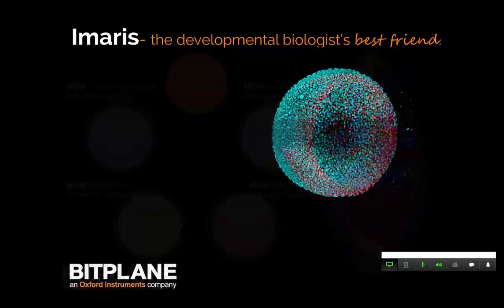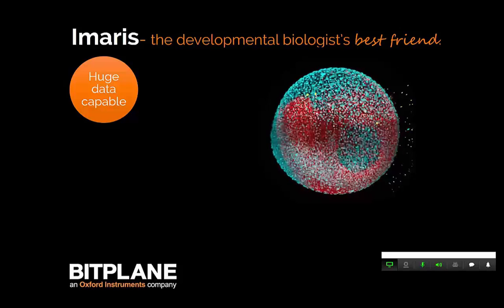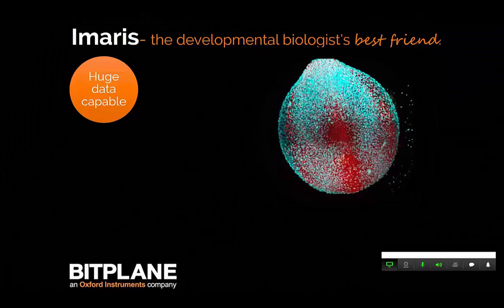So, to get things started, we have a zebrafish embryo, I believe, that was collected on a light sheet microscope playing in the right-hand corner.